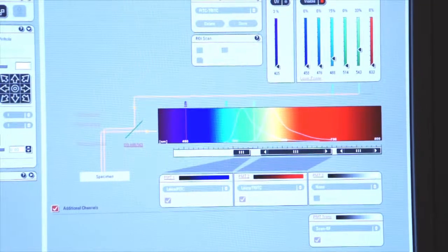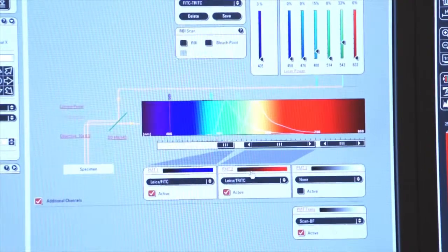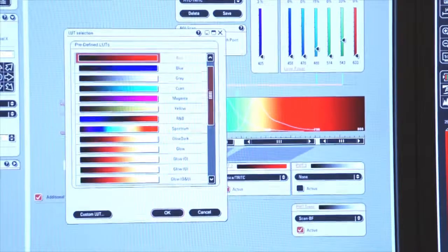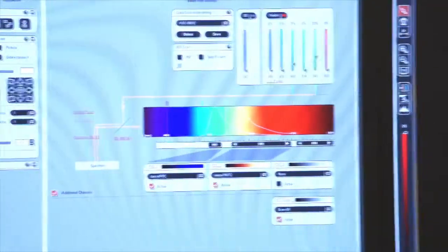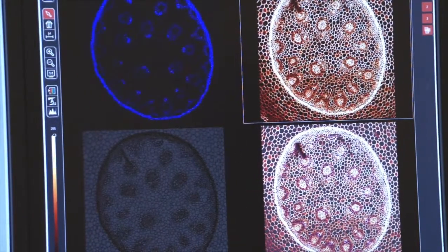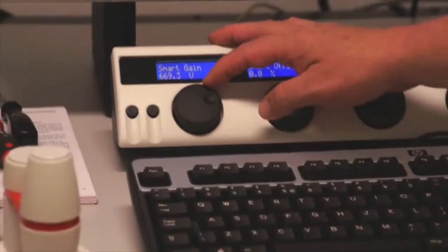Now if I want to change the color output on the red, I go to stop. I click on the red and let's make this one glow dark. Click OK. Now if I click on live, you can see that I have a completely different image. And I can control this again with my smart gain and my offset.